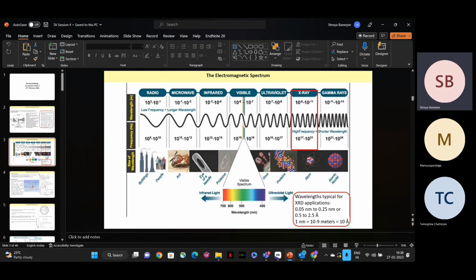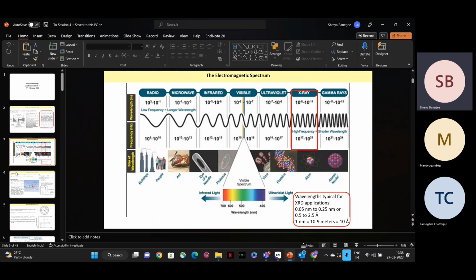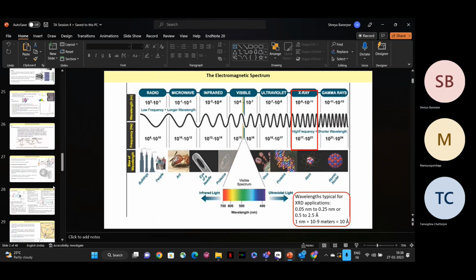If you go back to the wavelength range that you see here, the wavelengths produced by copper fall within it, but molybdenum, silver, and some other metals give even shorter wavelengths. Those wavelengths will pass through the gaps in the lattice, and it will not be able to detect the atoms.